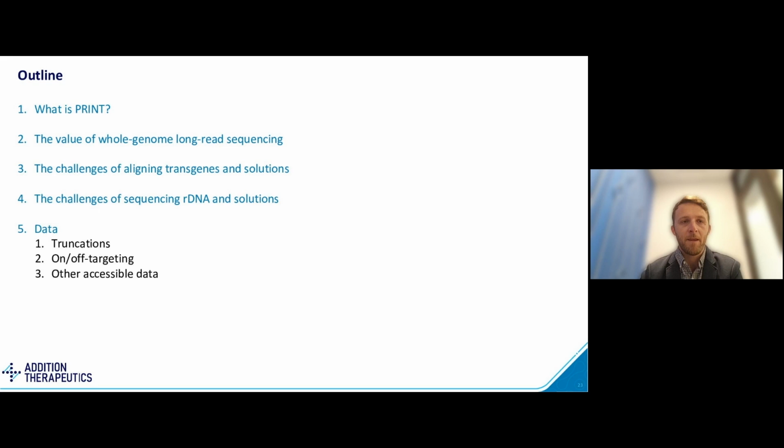Today I'm going to be talking briefly about what is PRINT, the value of whole genome long-read sequencing for our use case, some of the challenges that we've run into in aligning the transgenes that we're working with, as well as our target site in the rDNA and the solutions that we've come up with. And then finally, I'll talk about some of the actual data that we've generated.